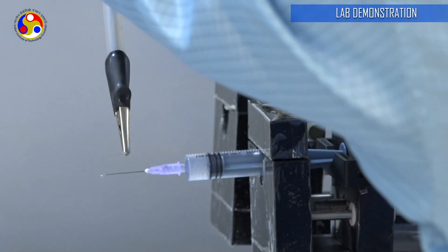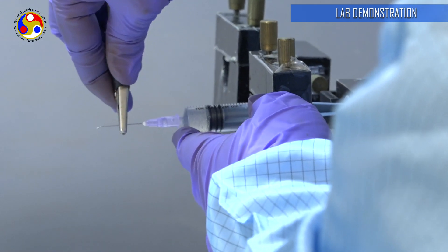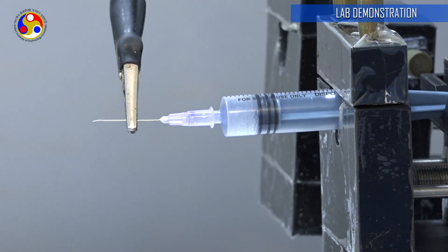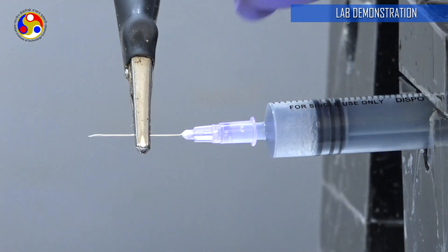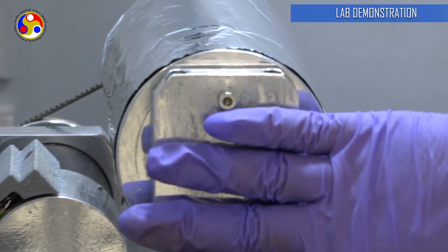It is important to remember that this high voltage power source, the high voltage that we are going to apply, is a very important parameter for the electrospinning process. The sample that will be released from the needle will be collected over here. This collector here is grounded.